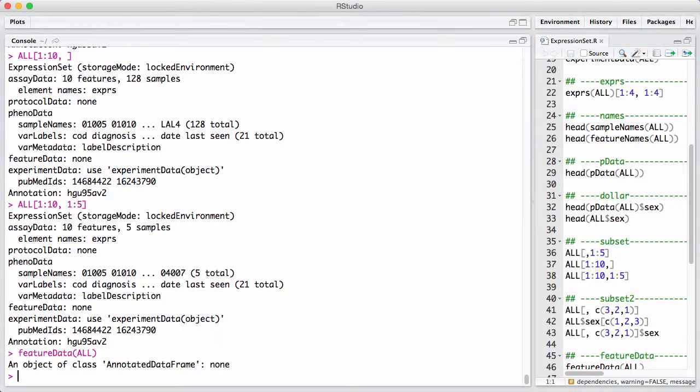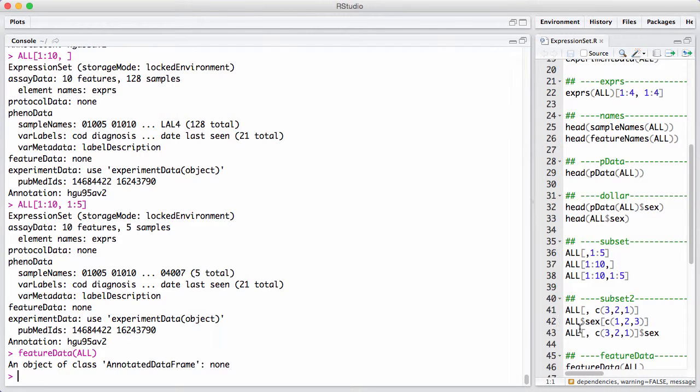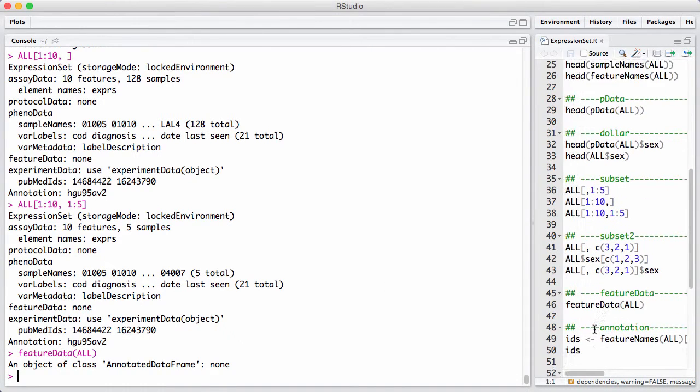Unfortunately, this slot here is, in most instances that I know of, empty. It can contain information about the genes, but in this case and in many other cases, people don't put the information into the object itself. We'll talk about that in a moment.